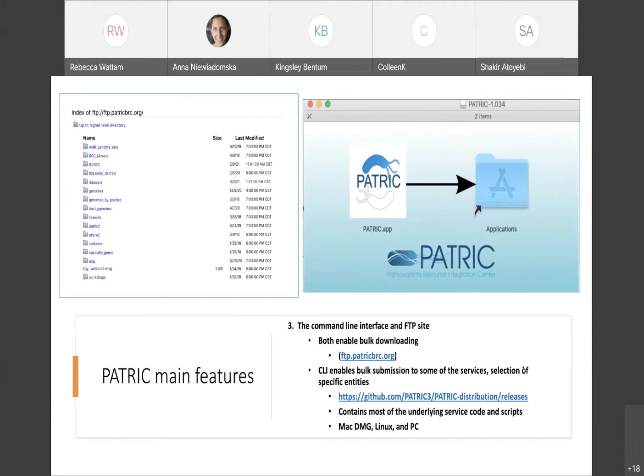We also provide you with the ability to get all the data. The bioinformaticians, routinely in the early phases of PATRIC, found it easier to get the data here than any place else. So they would just come in routinely, download all the data, and go away and have their way with it. So they were mainly doing this through the FTP site, which you see over here.